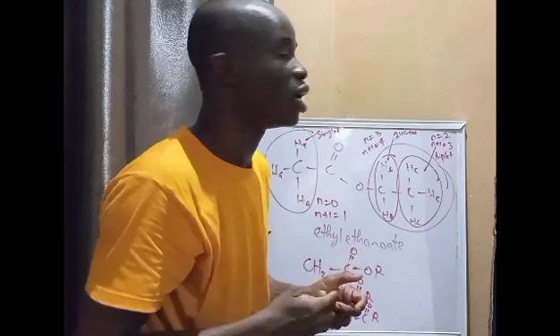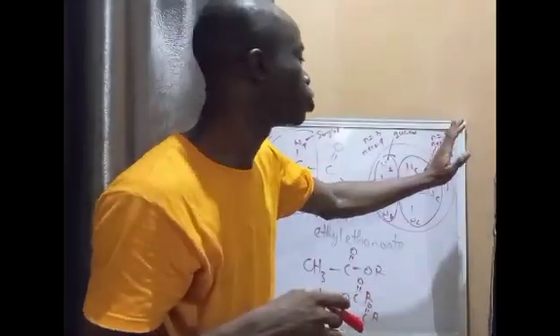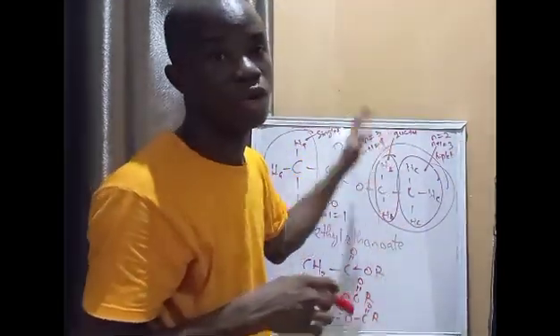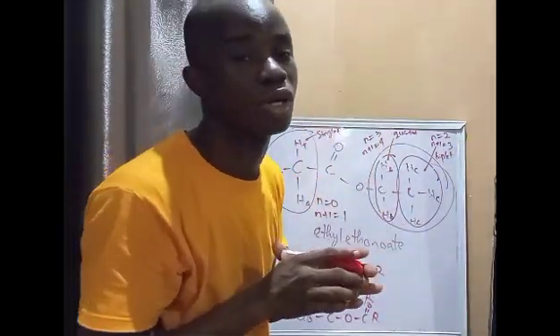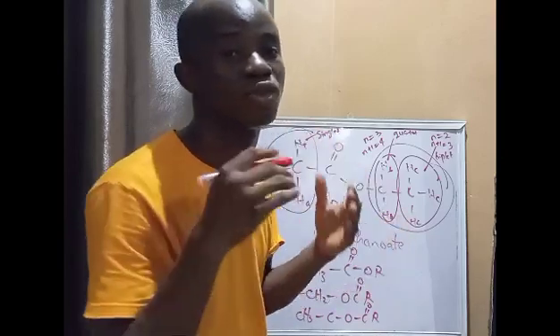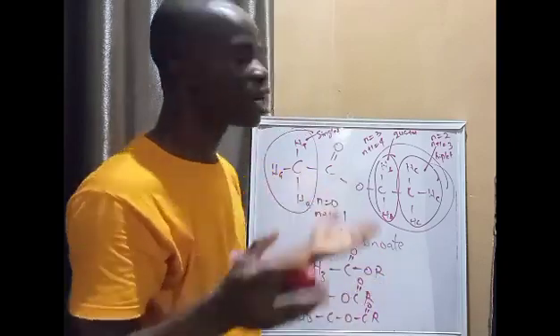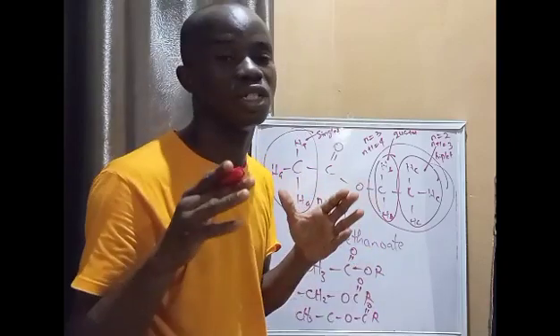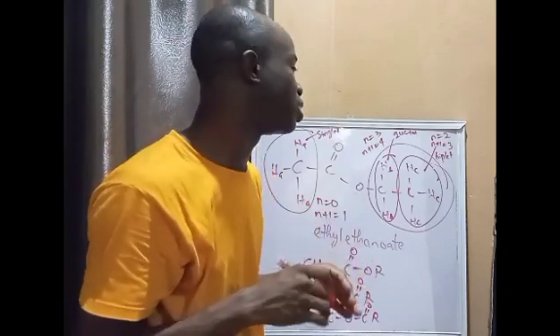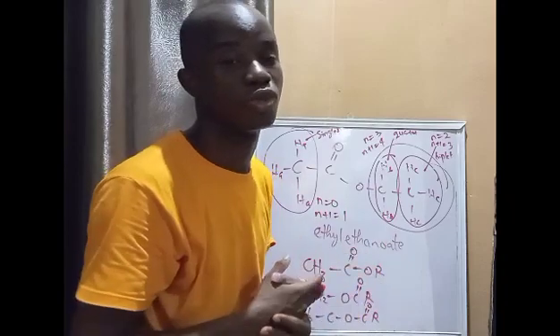And like I said earlier, as you can go from this place to get the multiplicity, when you are given the multiplicity, you can also use it to do a sketch of the structure of any given compound that your NMR represents. And the last thing I talked about is the integration of a signal, which I said indicates the number of hydrogens that are responsible for a particular signal.